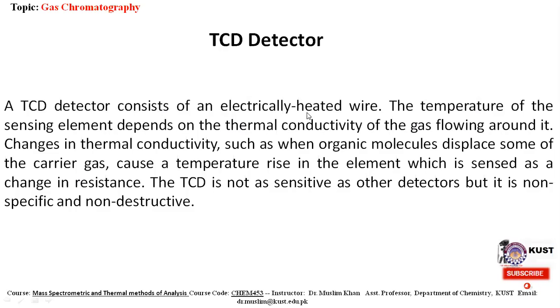Changes in thermal conductivity, such as when organic molecules displace some of the carrier gas, cause a temperature rise in the element, which is sensed as a change in resistance. The TCD is not as sensitive as other detectors, but it is non-specific and non-destructive.